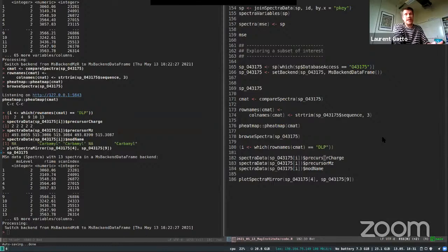Sometimes, like I showed here, this could be at the very beginning when you have the raw data. But in other cases, you might not have access to the raw data, or you might want to focus on the quantitative data and on the statistical analysis, for example, using MS-Stats TMT. And so in that case, you could start later on. I think that will very much depend on what your priorities are.